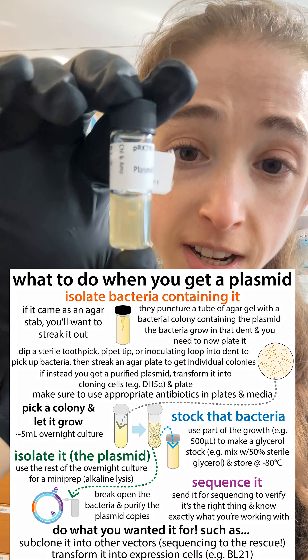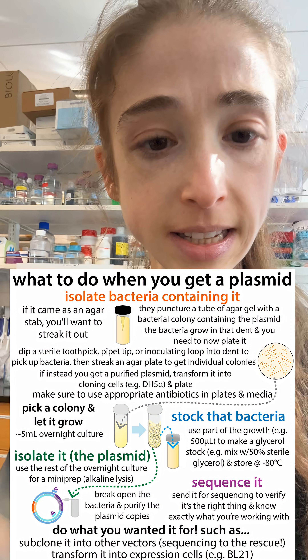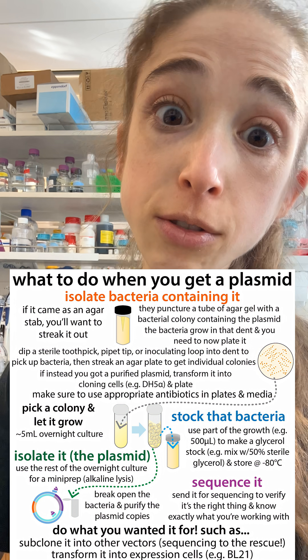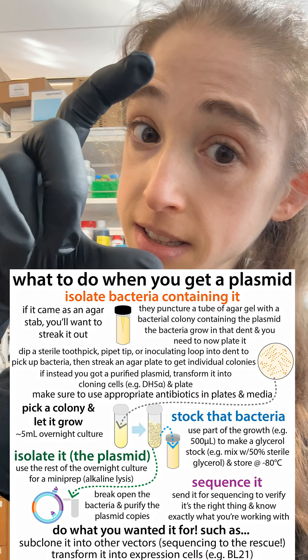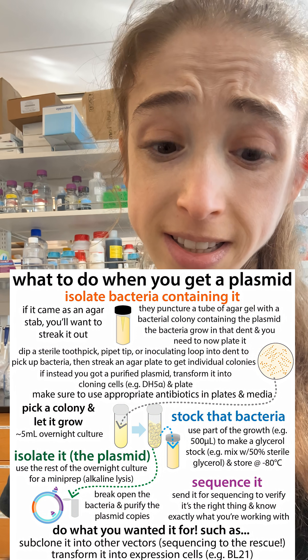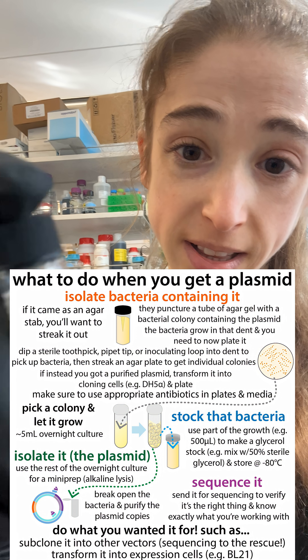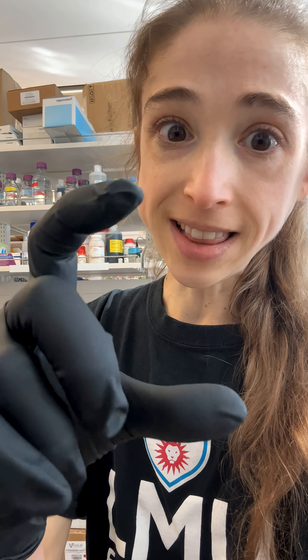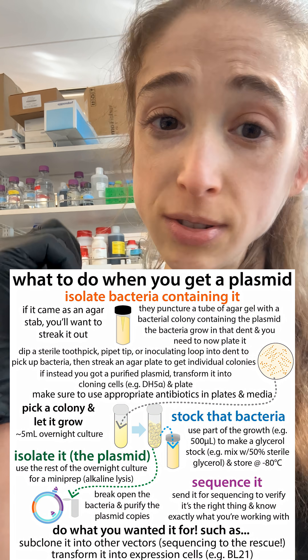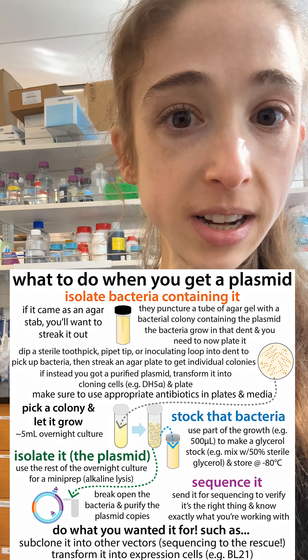It comes with the bacteria — just take a little of that bacteria, streak it out on a plate, isolate single colonies, and grow up the single colonies in a small amount of LB, like five mils or so. Make sure you have the antibiotics in both the plates and the liquid; it typically says on the vial what antibiotic you need. Then make some glycerol stocks, put those in the minus 80, and you can grow up more when you need it in the future.